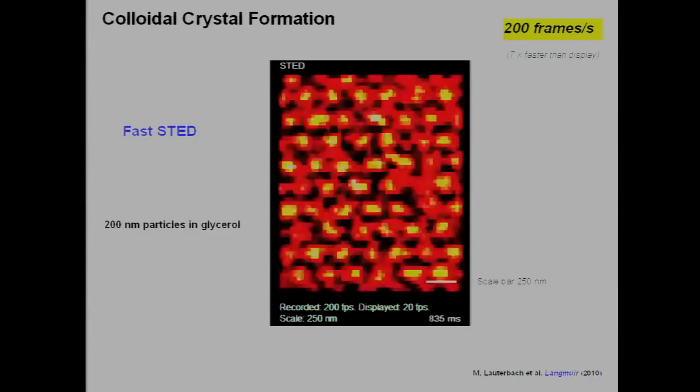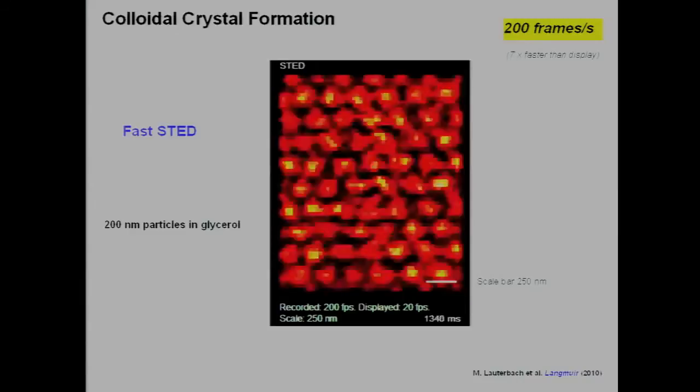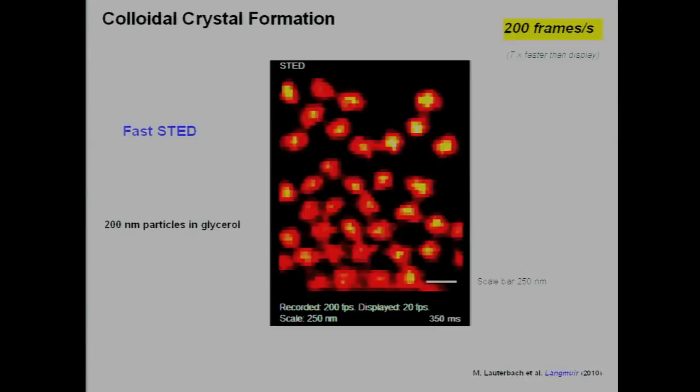Now, what is the speed limitation? The speed limitation is just given by the brightness of the molecules. Again, the molecule is the facilitator, but also the limiting factor. So the better molecules we have, the better the images we'll get. What is the obtainable resolution, talking about limits? Have we now pushed the resolution of the microscope to a new limit? Is it now 30 nanometers, 20, or 50, or what is it?